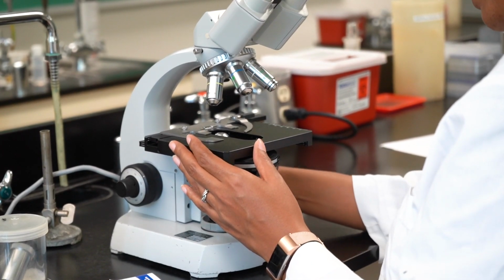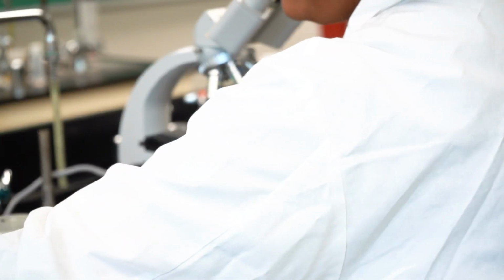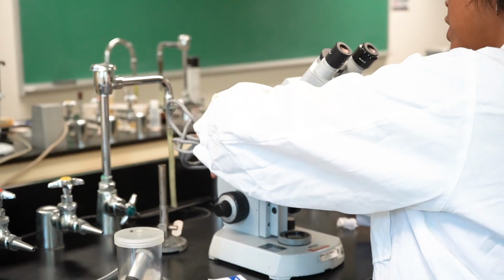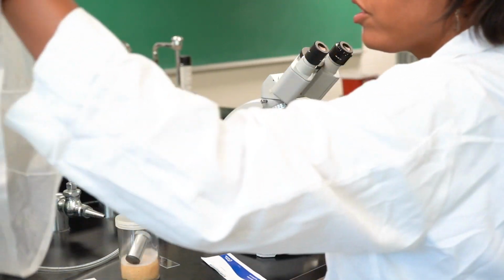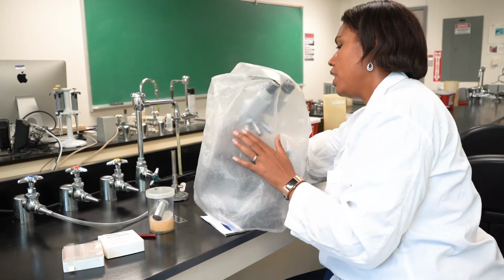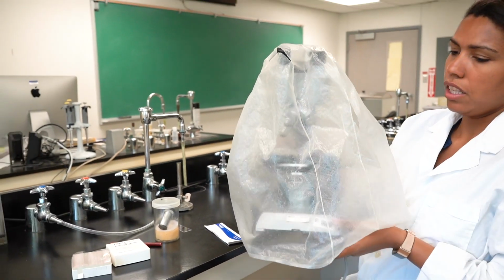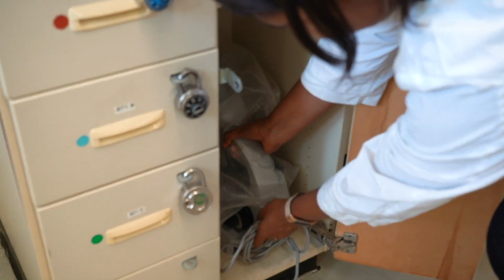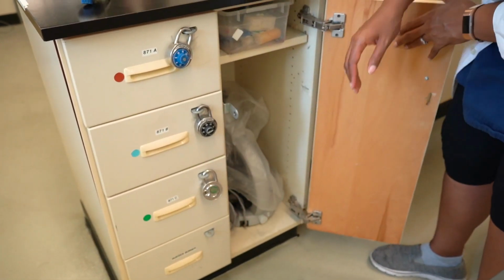All right. Now that everything is lowered, you also want to make sure the condenser is in its highest position. You're going to unplug the microscope, and then you're going to wrap the cord about your hand, and you're going to store it alongside the microscope. All of our microscopes have a cover, so you replace the dust cover to keep the microscope clean. And then carrying the microscope by the arm and the base, you replace the microscope into the cabinet, just like this, storing the microscope's cord alongside the microscope.